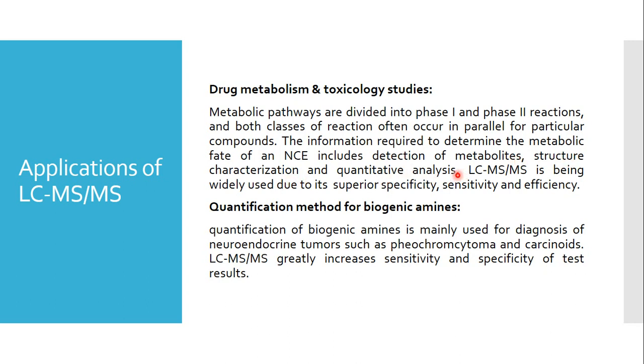This information about the new drug molecule is very important, that is, what is the fate of that drug molecule once it enters the body, because it can sometimes get converted to a toxic metabolite also. So the characterization and quantification of these metabolites is necessary. It is possible with the help of LC-MS. It offers superior specificity, sensitivity and efficiency.